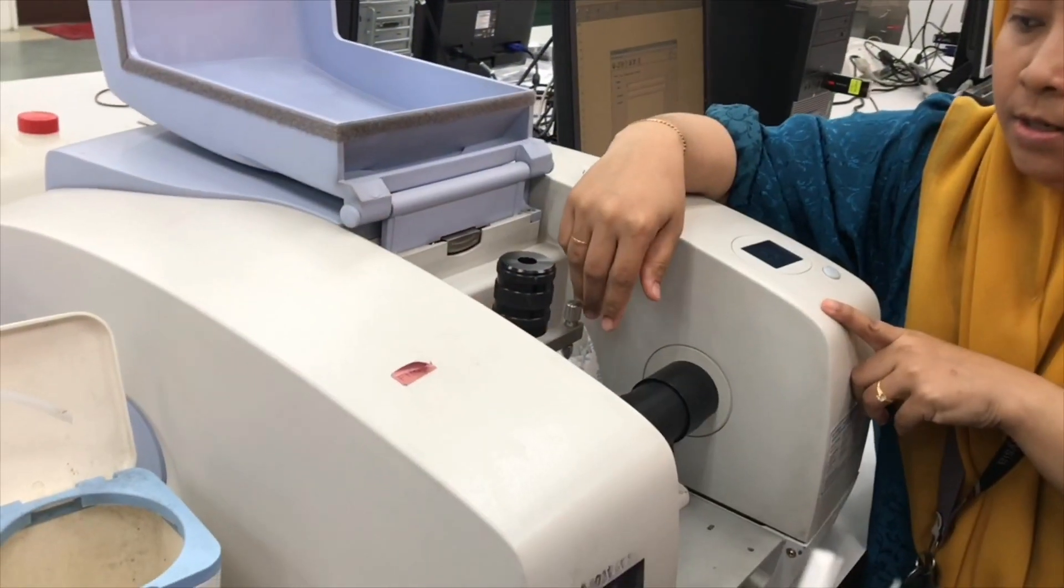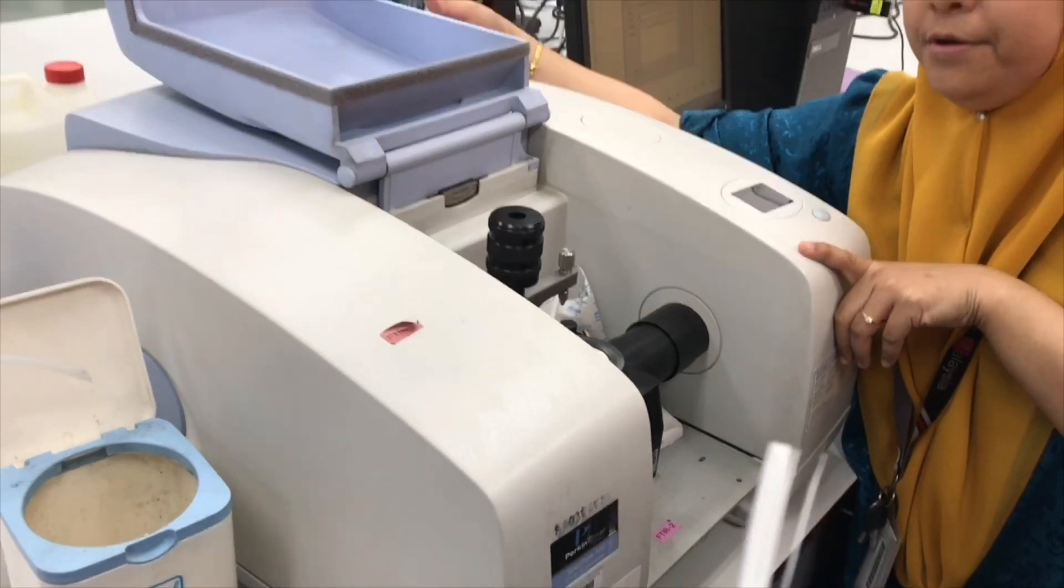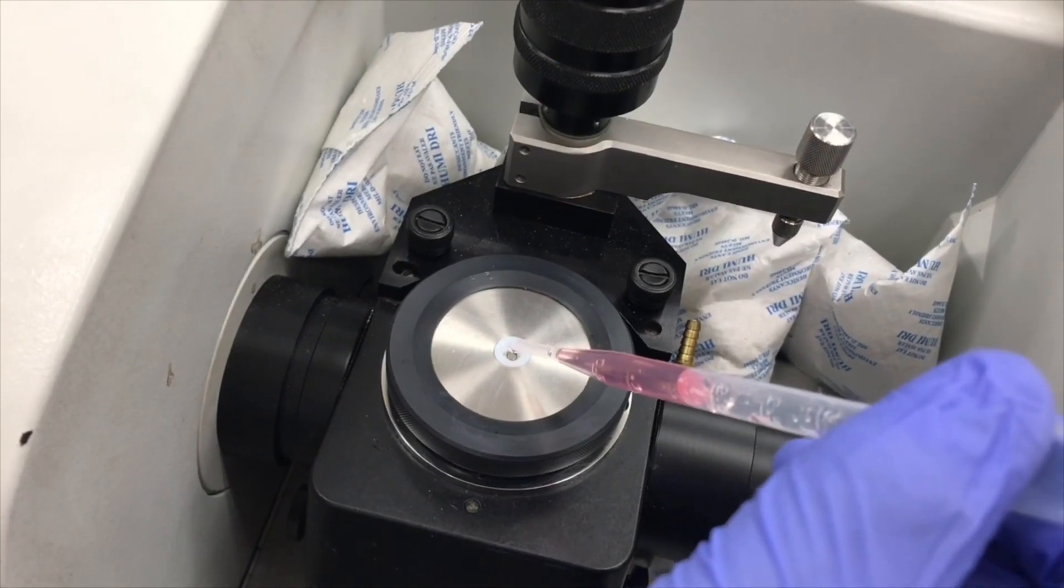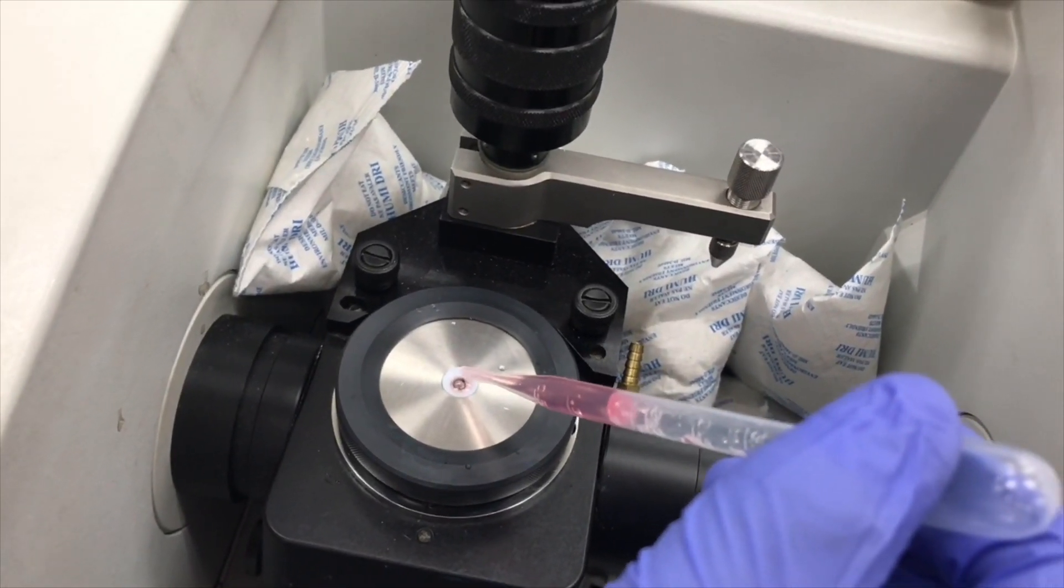Next I will show you the equipment that we use which is the FTIR spectrum 100, a Fourier transform infrared spectrometer. To start, just put one drop of our sample, which is the beverage, on the surface.